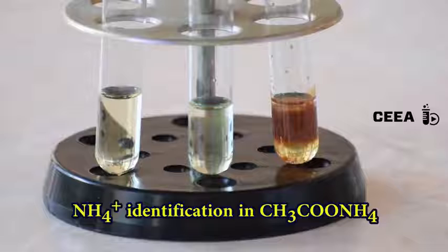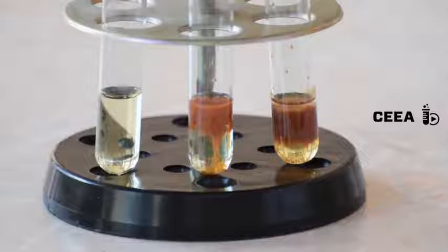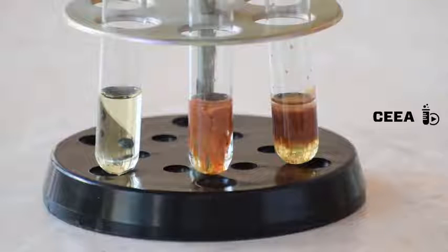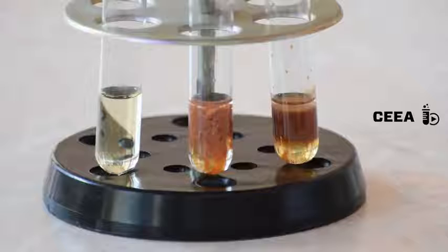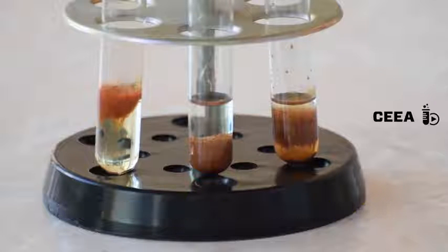Ammonium acetate gives the same response when mixed with the Nessler's reagent. Ammonia, which contains ammonium hydroxide, gives also a positive reaction.